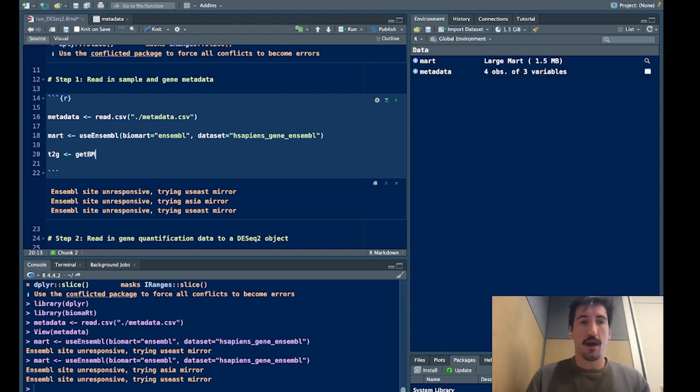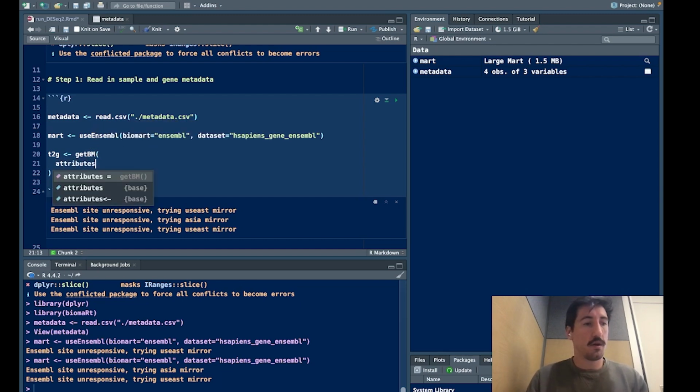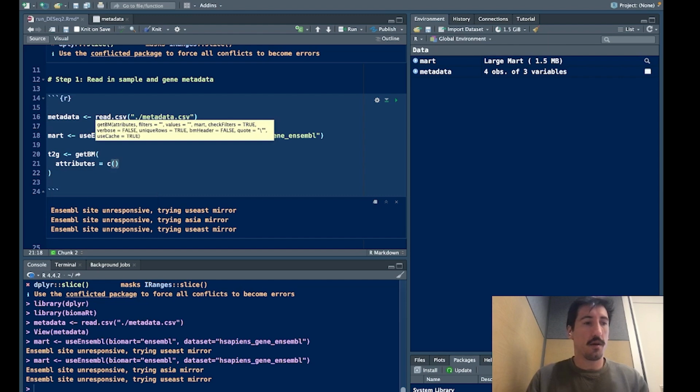And so now we need to filter this object for protein coding genes only. In this case, we performed poly-A tail enriched RNA sequencing analysis, so we're going to be only keeping the transcripts that are associated with protein coding genes.